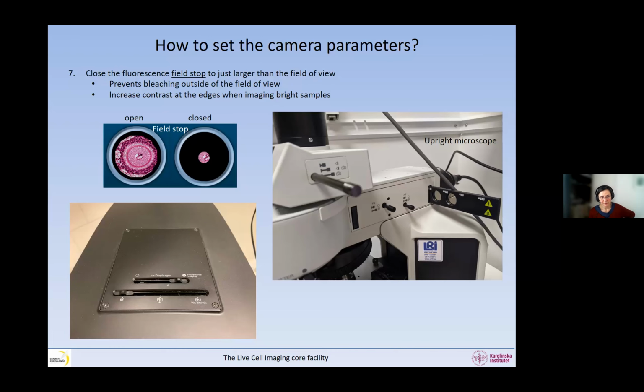If the camera fulfills the Nyquist criterion with the 60x, if you go to 100x, you're going to have a dimmer image, and you're going to oversample even more. So you don't have much advantage there. I would go for the smaller one, and I would crop the camera. You get less, so the files will be smaller, and you can acquire much faster if you don't acquire all the pixels. But I guess that if you oversample with the 100x objective, then you have less noise, right? Or at least less.